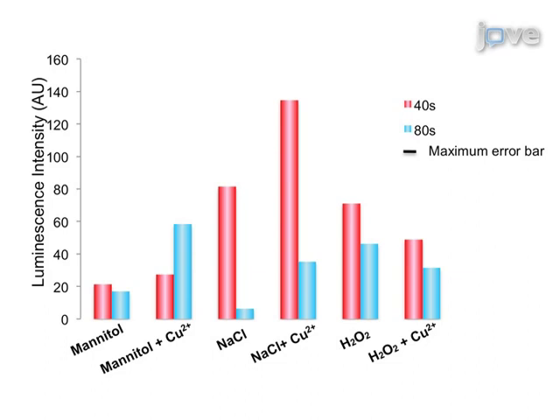And here is the bar chart of the average luminescence intensity of seedlings in response to the indicated stress stimuli.